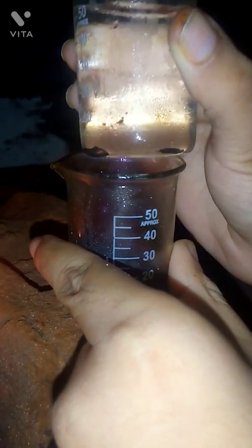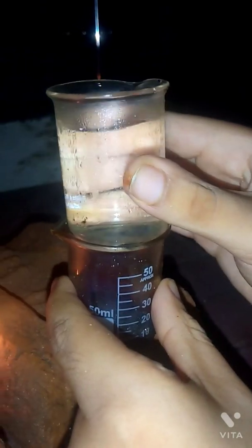Let's see what's happening now. Iodine vapors are still coming out, meaning it's not cold yet. Look at the bottom side. Shiny crystals are forming inside the beaker. It looks like a silver mirror, but it is not a silver mirror. It is iodine crystals deposited at the bottom.